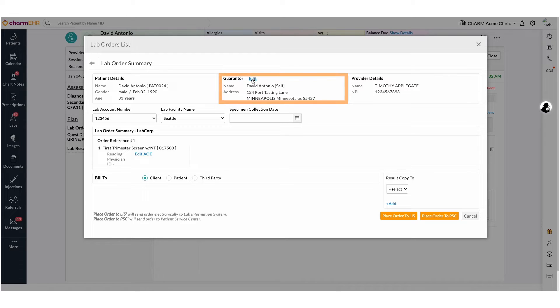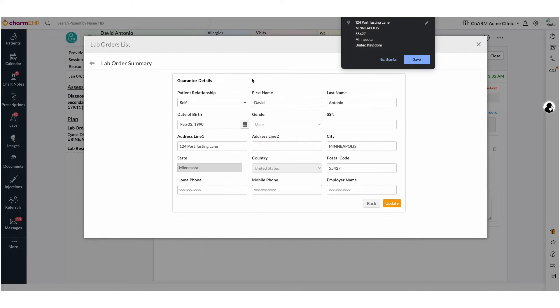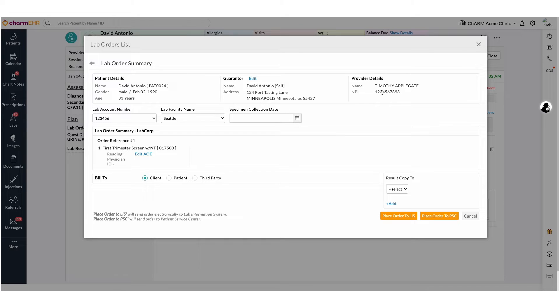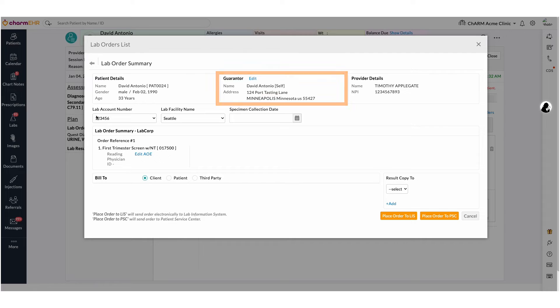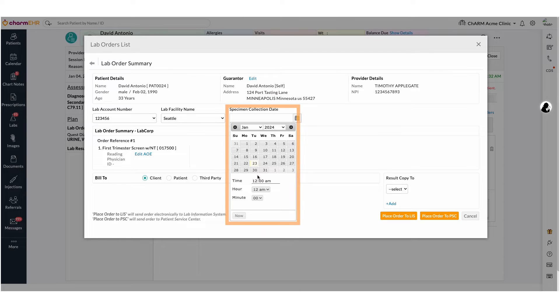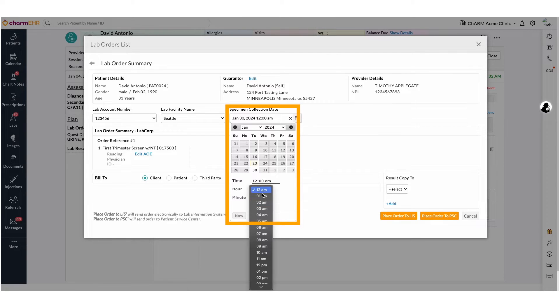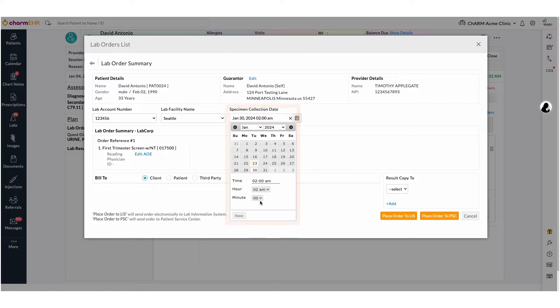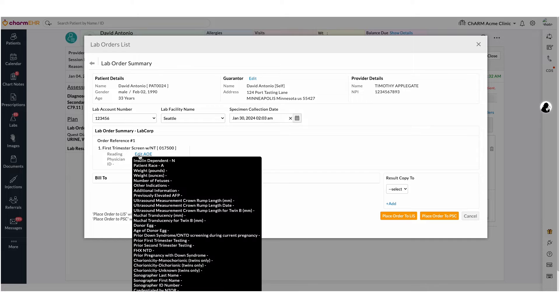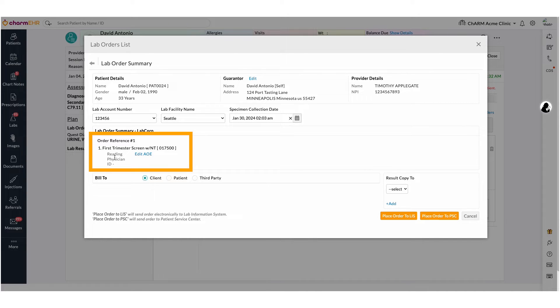Guarantor details are at the top of the page and can be edited if needed. If the guarantor details are configured in the Patient Demographics section, it will automatically be pulled here. If you have an in-house laboratory and are collecting specimens for this lab order, please fill out the specimen collection date and time.